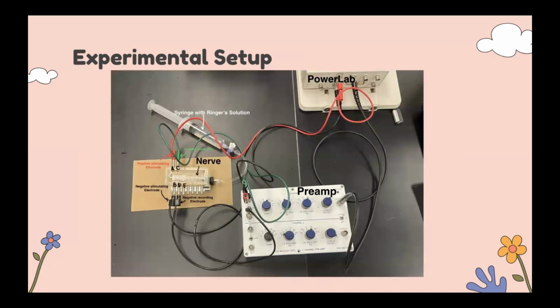And this is our setup that we made for our nerve chamber, which was connected to the preamp and to the power lab.